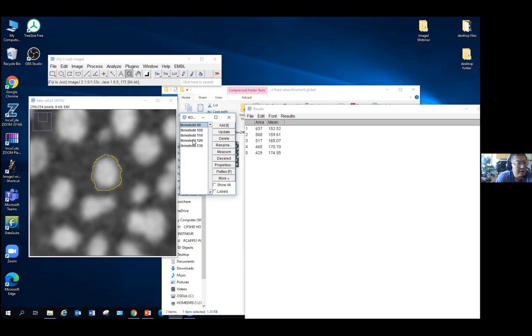So this is one thing: when you first choose what thresholding is the best, it's purely your choice. But once you decide the value, you need to make sure that this value is used on all the images. That's the best scenario. But in reality, many times it's not that perfect. Sometimes you just don't have the luxury to apply a single thresholding value to all your images.